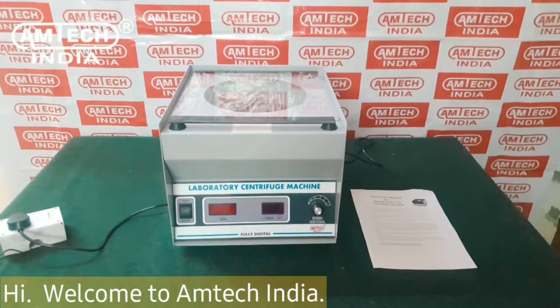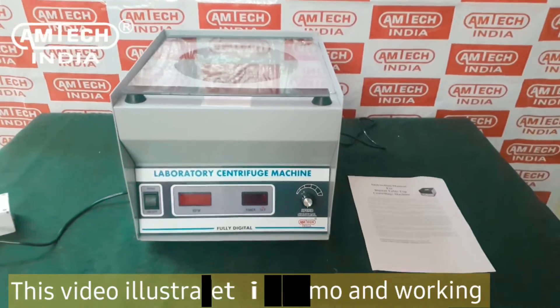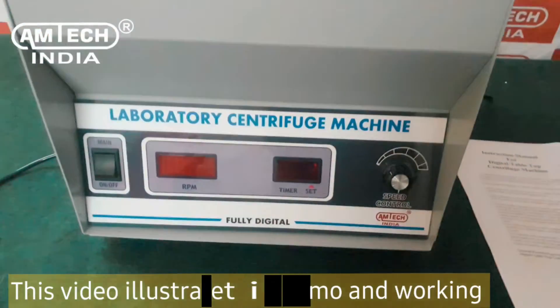Hi, welcome to Amtech India. This video illustrates the demo and working of a digital benchtop centrifuge machine.